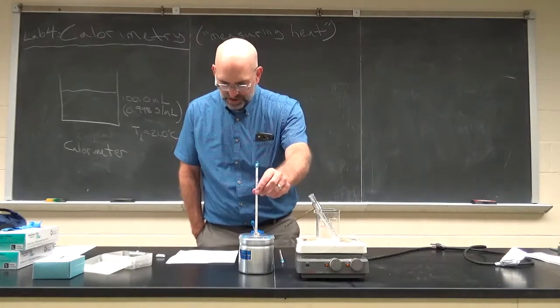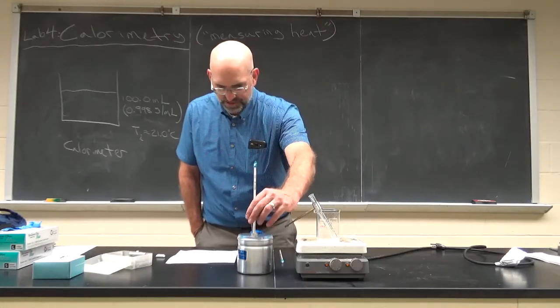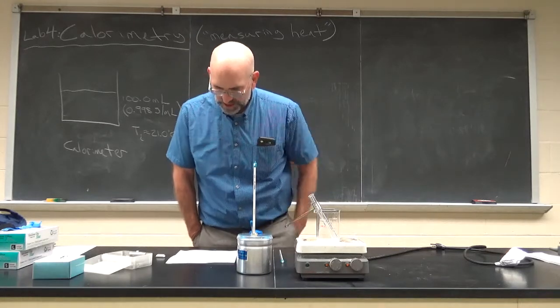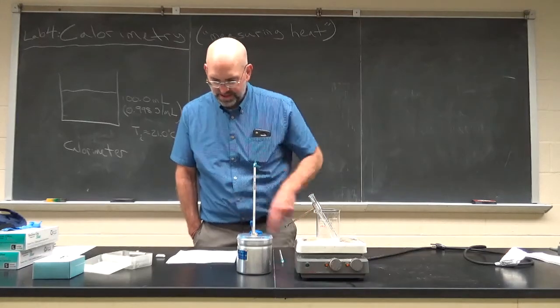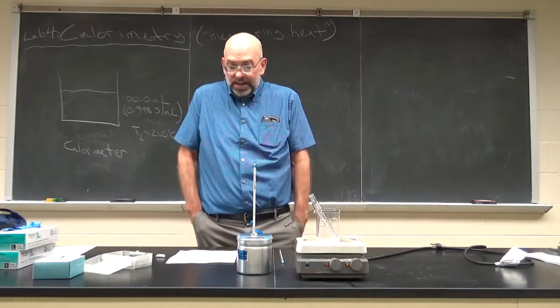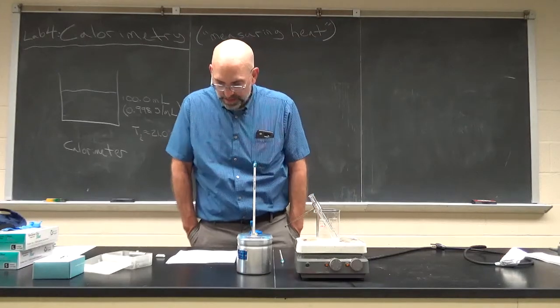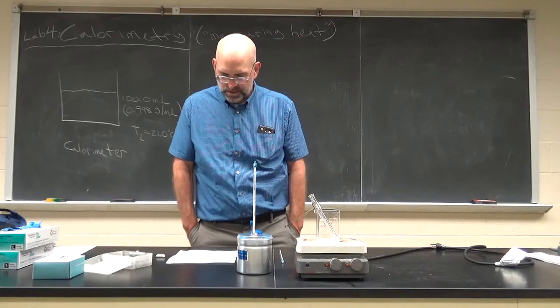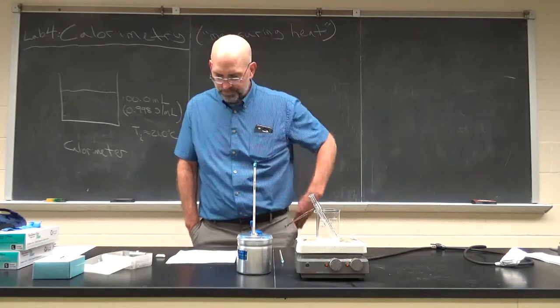Stir the water using the thermometer or the little stir bar, or the little stirring device, until you reach the highest temperature observed. It's not going to go up very much. That is the final temperature. Excellent.